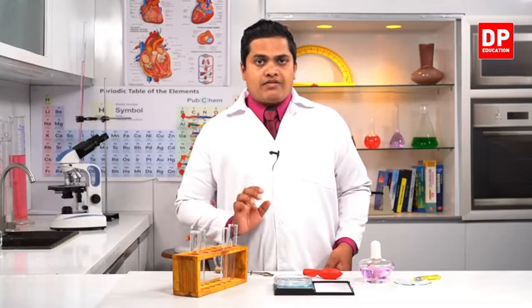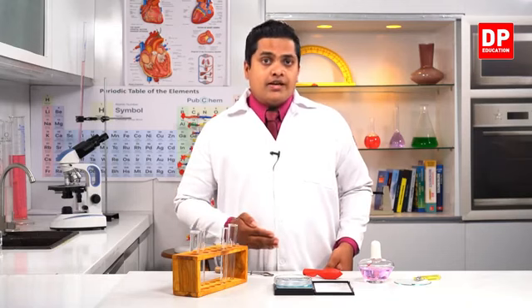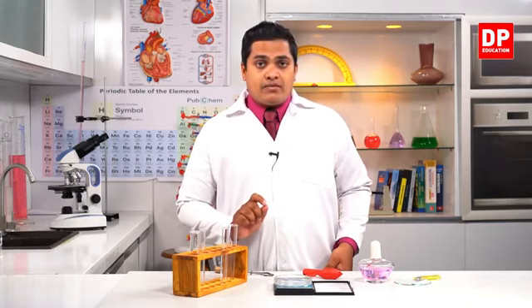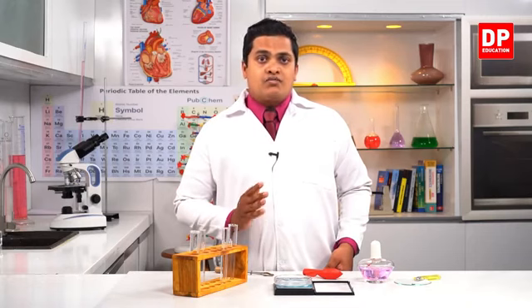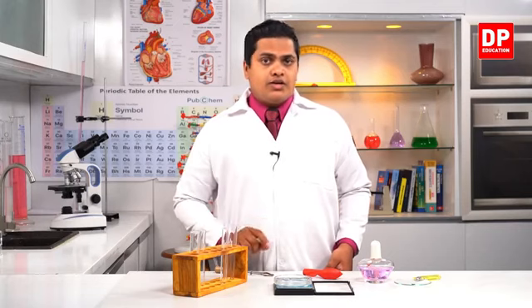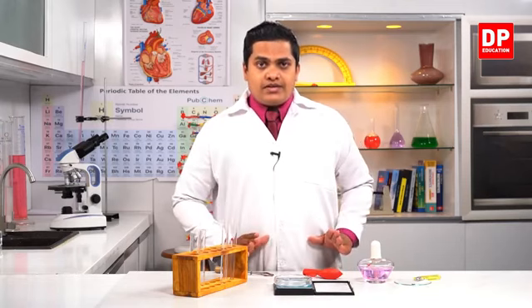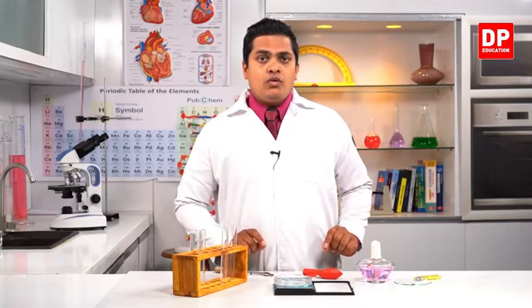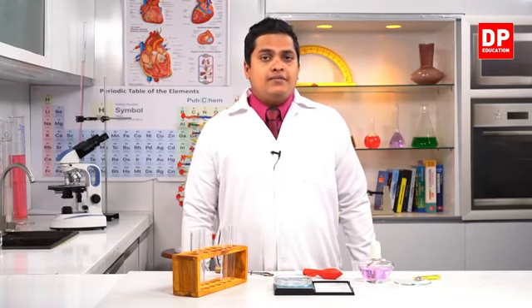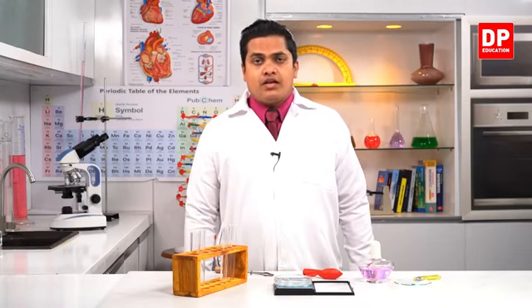We did chemical reactions in an open system. So when I'm burning matchsticks, you could observe that smoke is getting emitted from the system, from that boiling tube. Now in this activity, we are going to enclose the entire system, and let's identify whether there is a change in the mass of the materials or not after the chemical reaction.